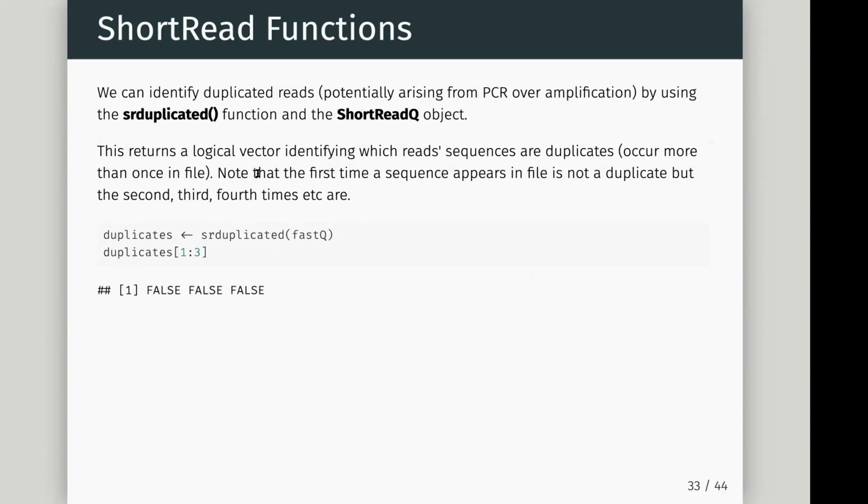Potential problems in sequencing. One potential problem is that you go in with a library where you just don't have enough complexity. For whatever reason, maybe you started with a very low cell number and you haven't captured much RNA, which has then been turned to cDNA, or you've done a ChIP, an IP, and it wasn't very efficient. You didn't really pull down much. At that point, when you sequence it and you do things like PCR, you're going to get very biased in your amplification, and you're just going to see lots and lots of the same sequence occurring in your data.